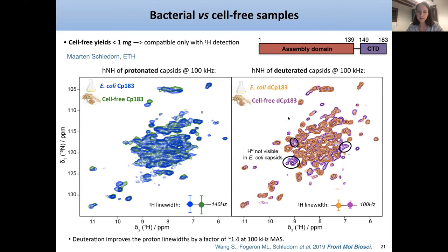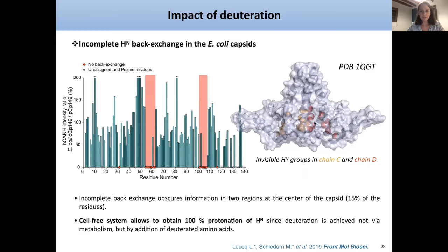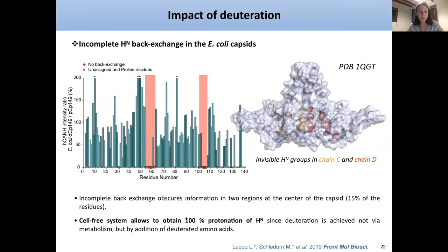However, as you can see in the orange spectrum, some peaks are missing because of incomplete back exchange in the capsid — specifically in the center of the spike, where residues are buried inside and not accessible to solvent. This represents 15% of residues. So we lack important information in the deuterated E. coli capsid. That is an advantage of the cell-free system: it allows 100% protonation of the amide proton, since deuteration is achieved by simply adding deuterated amino acids rather than through metabolism.